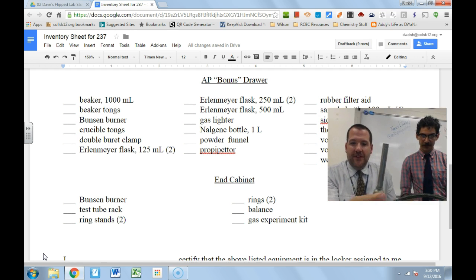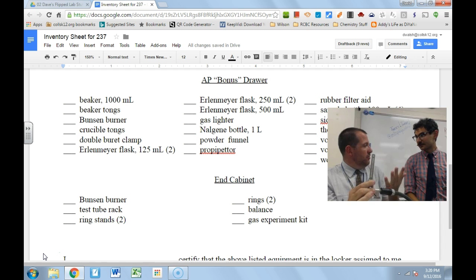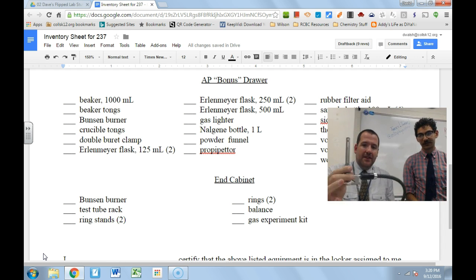This is everybody's favorite piece of lab equipment — the Bunsen burner. We're actually going to have a separate video about how to use a Bunsen burner, what to look for and things like that. This is the Bunsen burner and it has a hose attached to it.